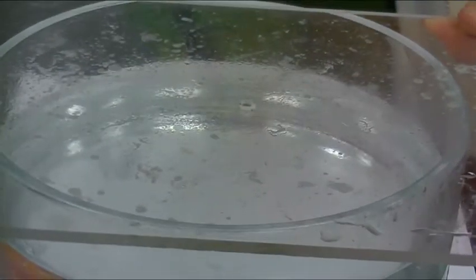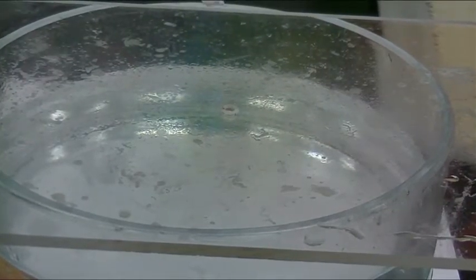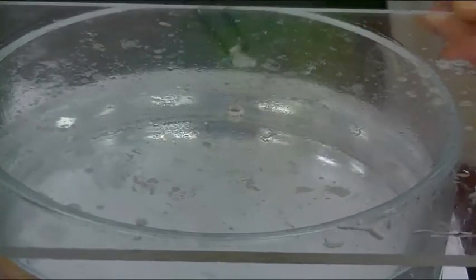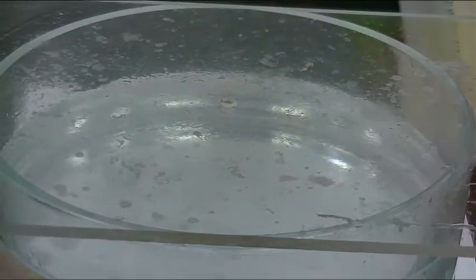All right, if we're going to see sodium catch on fire, what color from our flame test earlier this year would you expect to see if sodium catches on fire? I think yellow, right? Bright yellow color. Let's see. All right, here we go. Fingers crossed. It doesn't catch on fire. It's just going to be anticlimactic.